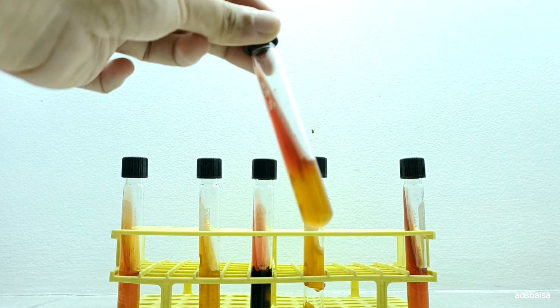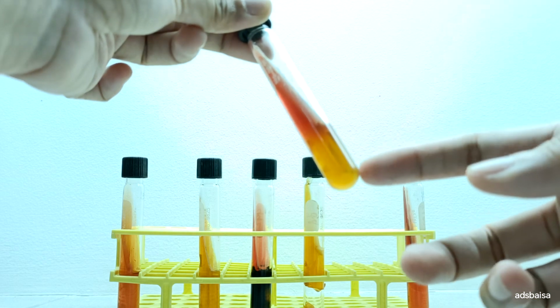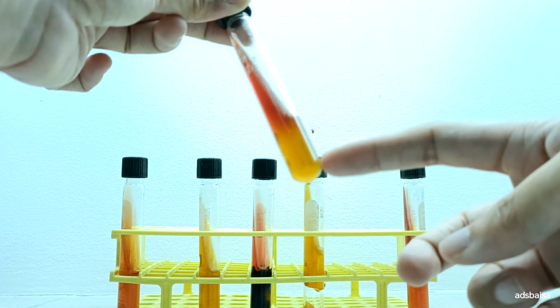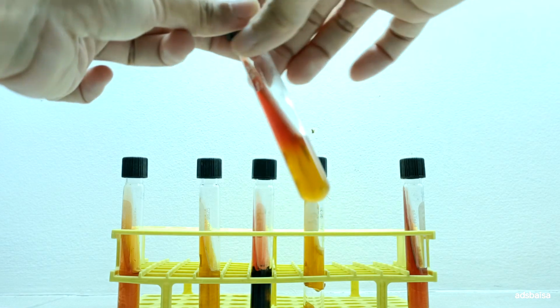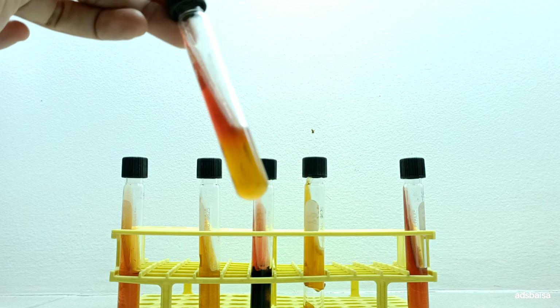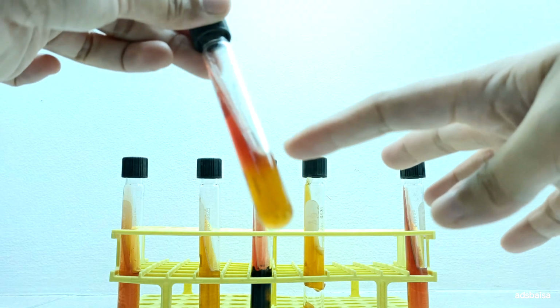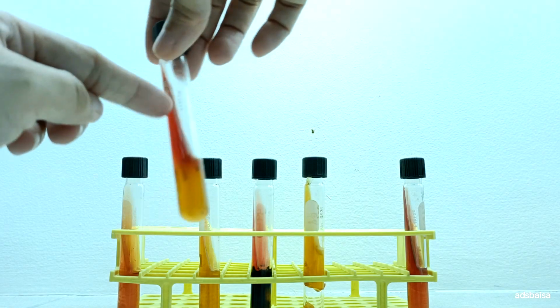So this reaction is due to the fermentation of glucose, in which the phenol red indicator turns yellow due to the increased acid, or due to the persistence of acid formation in the butt. The slant remains red or alkaline because of the limited glucose in the medium. Remember, it only contains a 0.1% glucose concentration. Therefore, there is limited acid formation which does not persist. That's why it remains alkaline.